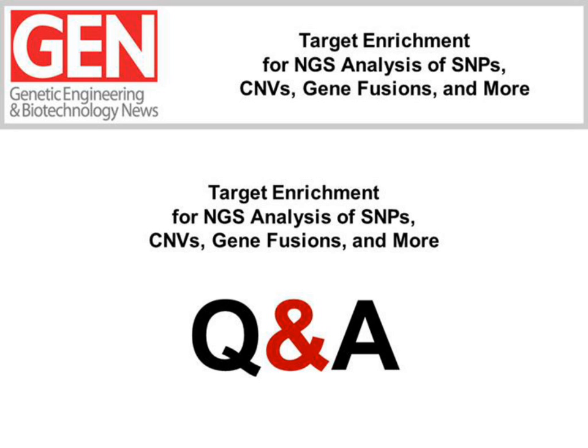Okay. Did you try your technology on WGA DNA? If yes, how well does it work compared to bulk DNA? So this is Jonathan. We've had customers use WGA to input from single-cell levels of DNA, and then they've fed back the data to us. What we found is that the assay performance is essentially unchanged in terms of the on-target performance. But what happens is the evenness of coverage decreases, basically, because the amplification itself adds some bias into which regions are amplified.